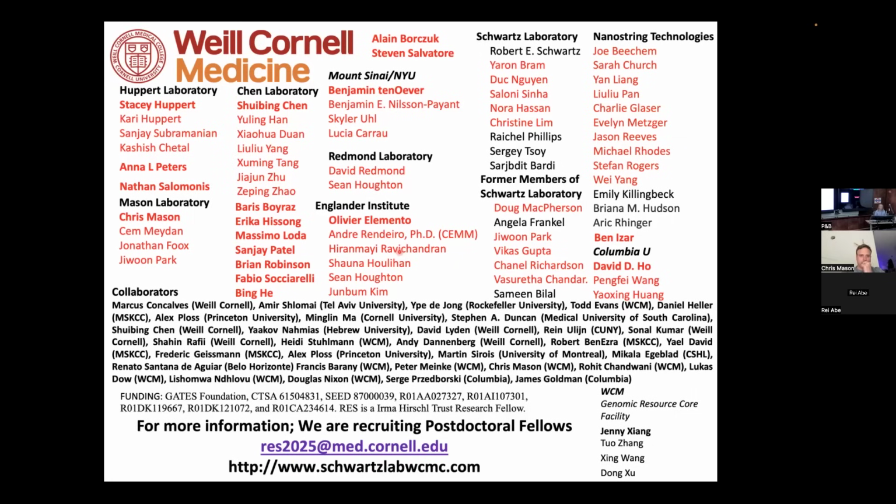And as you know, the smaller you get, the less specificity and sensitivity you have on the metabolites. So there is a give and take that you guys have. What resolution are you doing on DESI? We're starting at 60 microns. 60 microns, yeah.